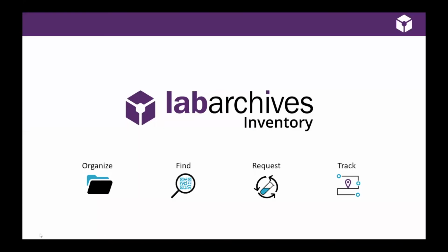Welcome to this introductory video on LabArchives Inventory. LabArchives Inventory is a cloud-based solution that supports the organization, management, and tracking of inventory items used within a lab, both lab-created and vendor-supplied.